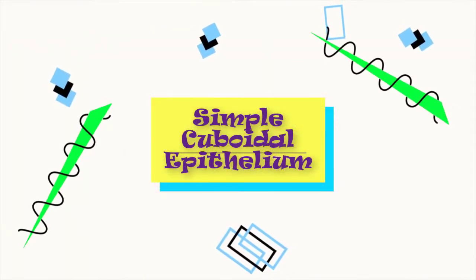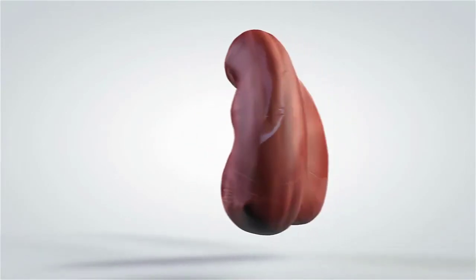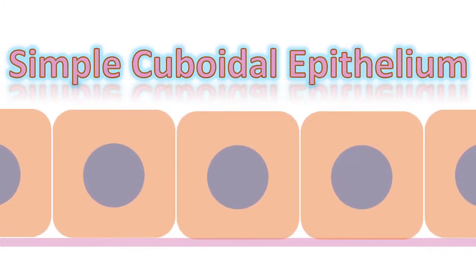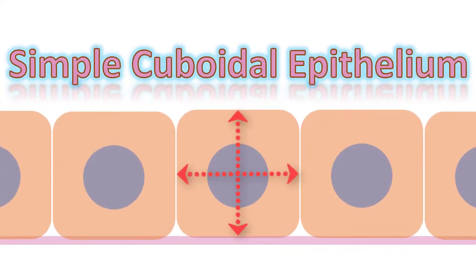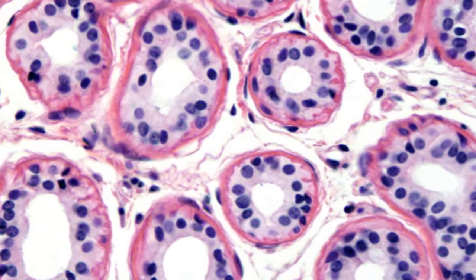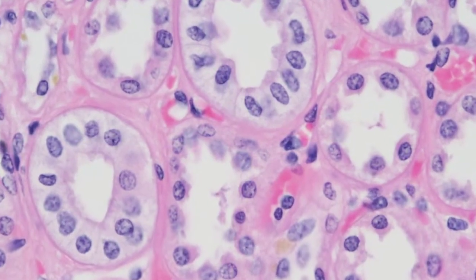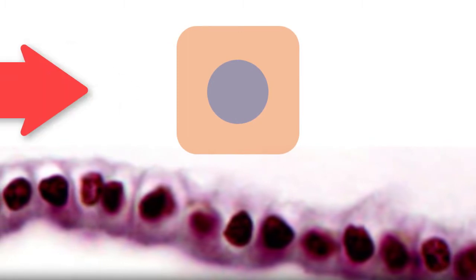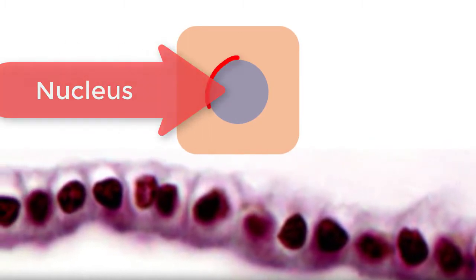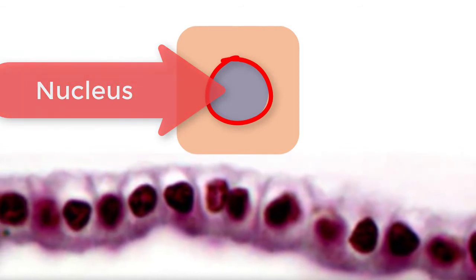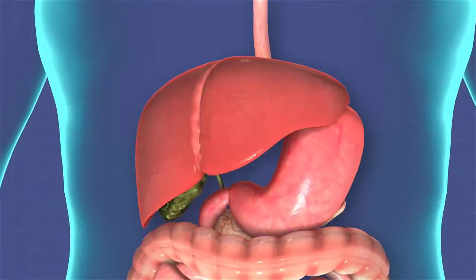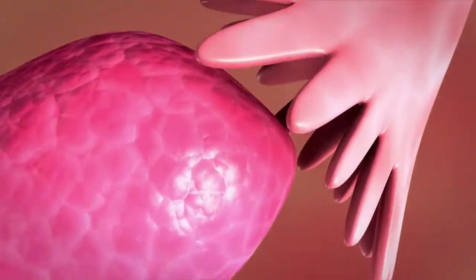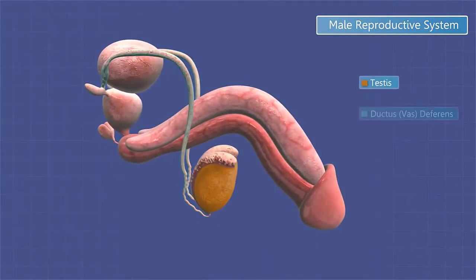Simple cuboidal epithelium lines the renal tubules of the kidneys and glands. The identifying features are that the cell shape is relatively square — typically as high as they are wide — though they don't form perfect squares inside the body. The best way to identify this tissue is to look at the nucleus: the nuclei will be relatively large and circular, located in the relative center of the cells. Simple cuboidal epithelium is also found in glands like the pancreas and in the gonads, covering the ovaries and lining the walls of seminiferous tubules in the testes.